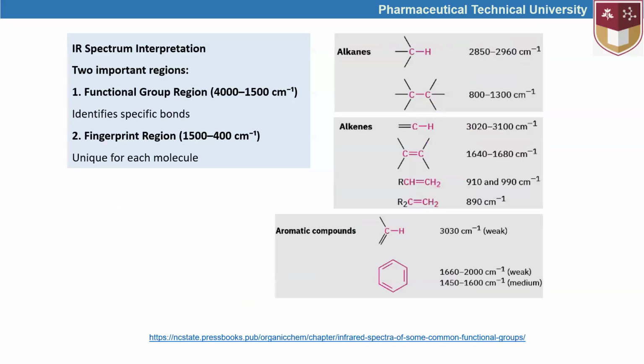Okay, next. These figures enable us to more appropriately understand what we have been talking about in IR spectroscopy. Here there could be, let's say, three hydrogen atoms, and this is hydrogen, yeah? These interactions might have wave numbers in the range from 2,850 to 2,960 reciprocal centimeters.